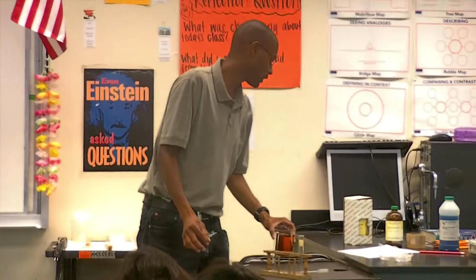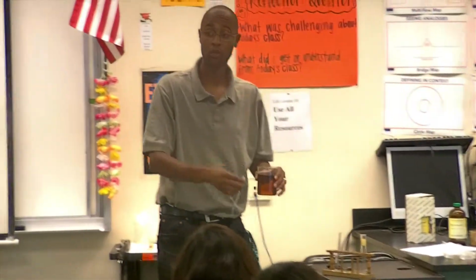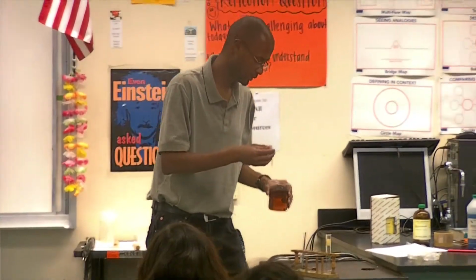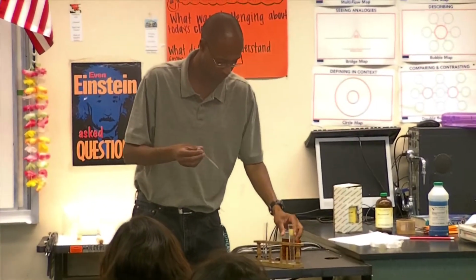Alright, the next part, glucose. Now, leave that to the side here. Let's find out if glucose moved to the bag. So we're going to do our typical glucose test. Take some of my sample here and put it into this test tube.